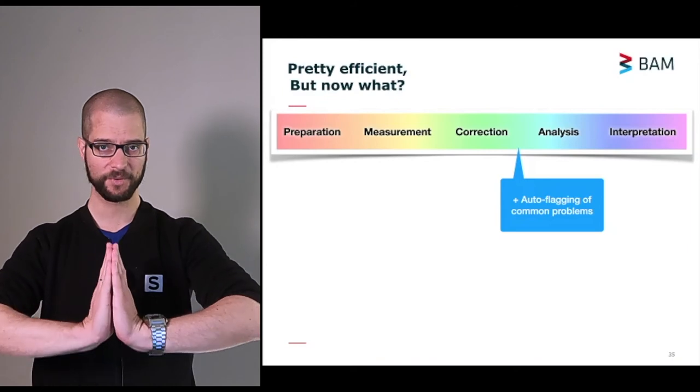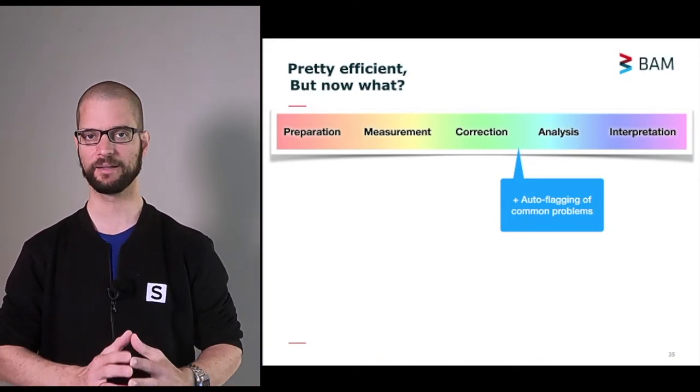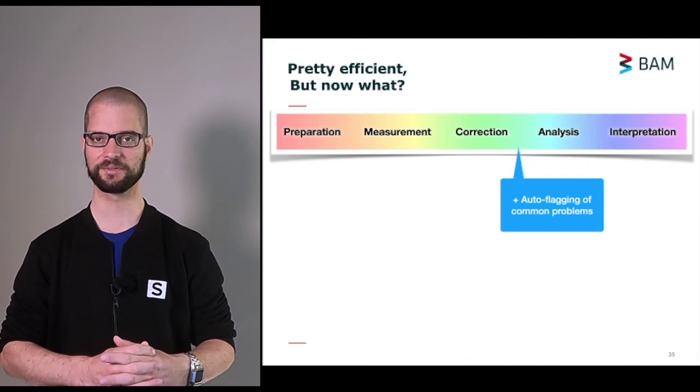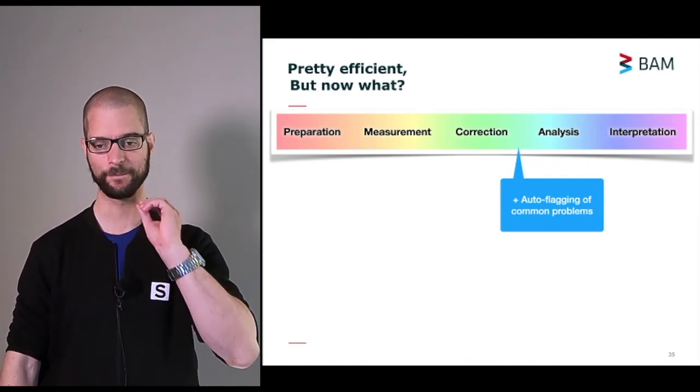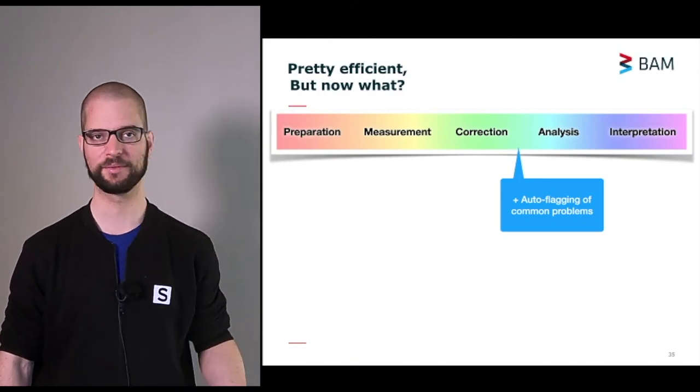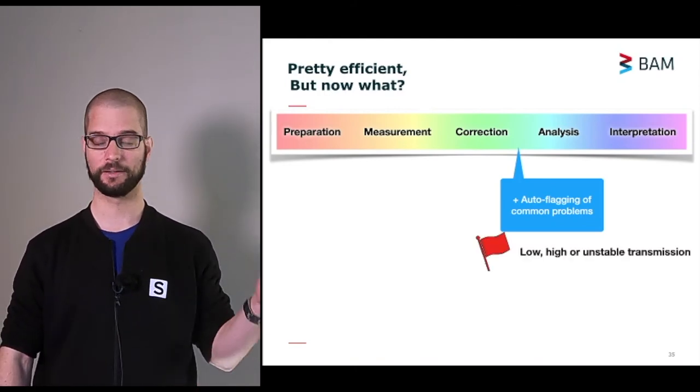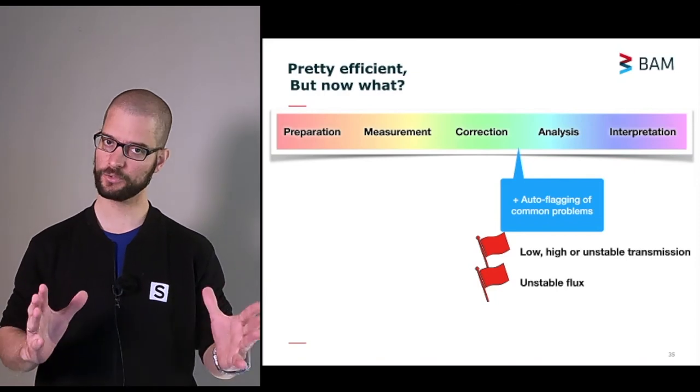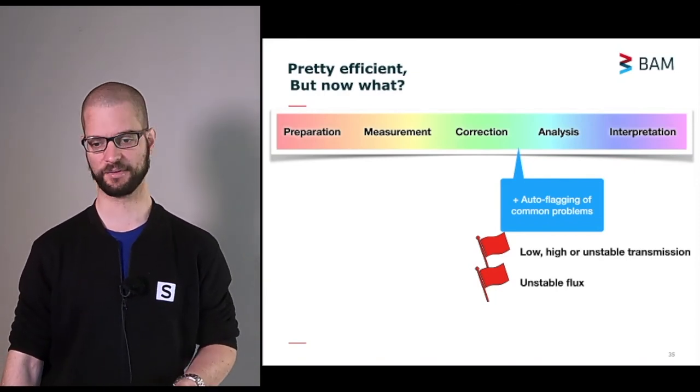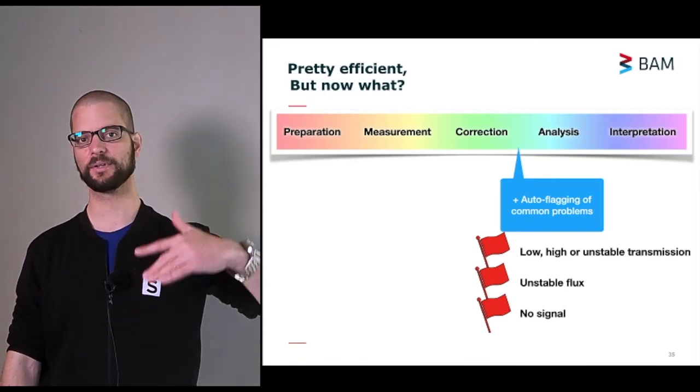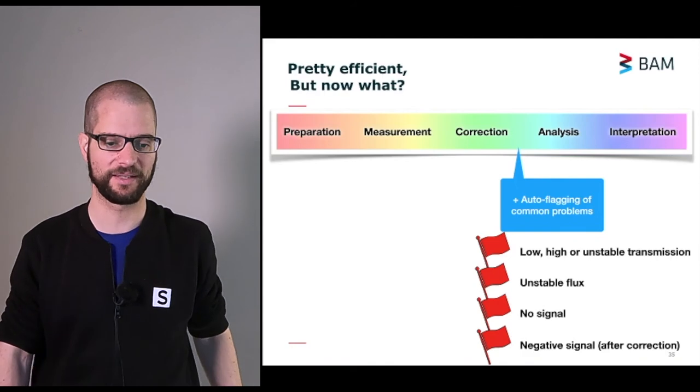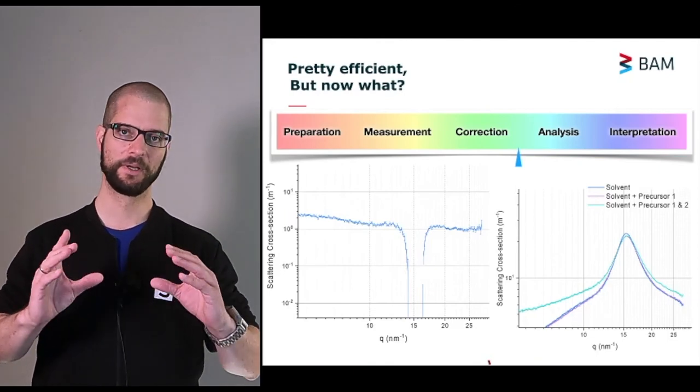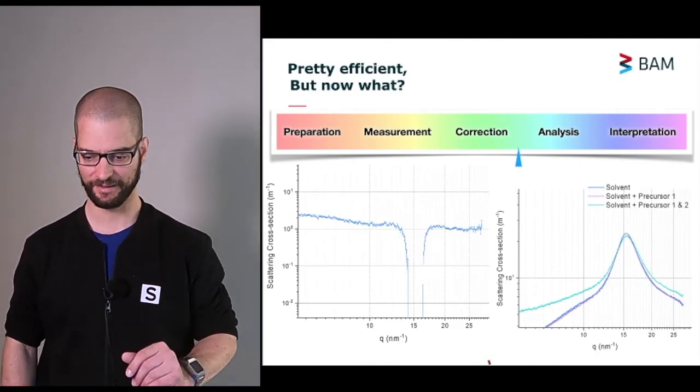After the correction, and this is something we actually already are doing, we can automatically flag common problems, so that we don't have to investigate when we notice something about the data, we can have problems automatically flagged, so we know which measurements to repeat. This includes things like low, high, or unstable transmission factors, unstable fluxes. If our machine is not stable, it's usually stable, but, you know, it has its moments. If there is no signal, or no significant signal above the background, or if you get some things like negative signal after correction, which means you've chosen the wrong background, or your background, which you thought would not change, is actually changing, like in the example shown here.